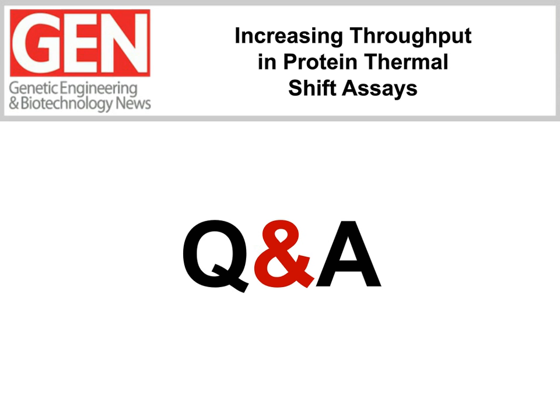So that message actually comes from the block, and so you can say that you want only 5 acquisitions, and it ramps over one particular temperature range. And if you want to pick up something like 25 acquisitions, then the ramping rate would be even slower. So that's how you control the ramp rate. And absolutely, you can do that on a 1536, a 480, and a 96 instrument. Yeah. Great. That's excellent. Well, thanks, Rama.